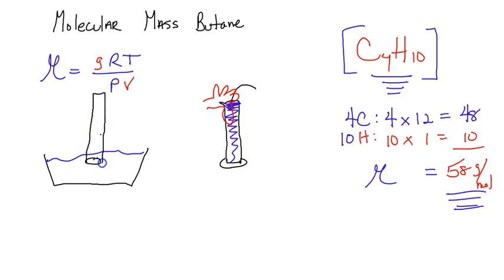And of course, what you're going to have is the water will still be suspended as long as it's submerged in the water bath. And the reasoning, of course, we've been through this, is that atmospheric pressure can definitely support that column of liquid. In fact, it can support up to about 32 feet of water in a column. And that's where the first unit of pressure came from. Okay, so big deal. So we've got this scenario going.